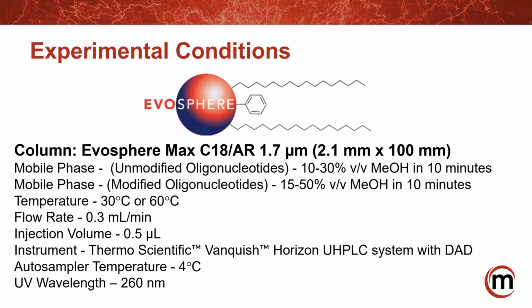Okay, thank you, Perry. Geoff, I have a question: what's the column lifetime for this application? Because it's not ion pair, we're not having to work at extended pHs and extended temperatures to get the analytes on and off the column.